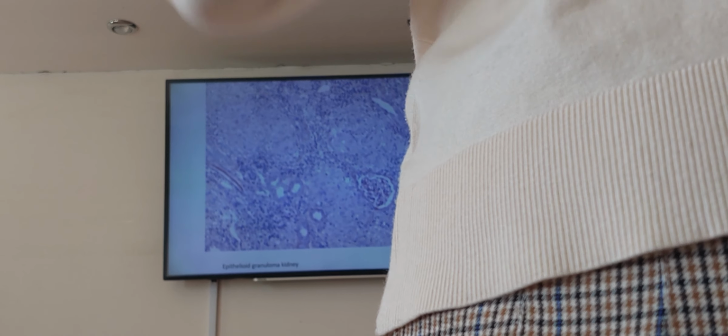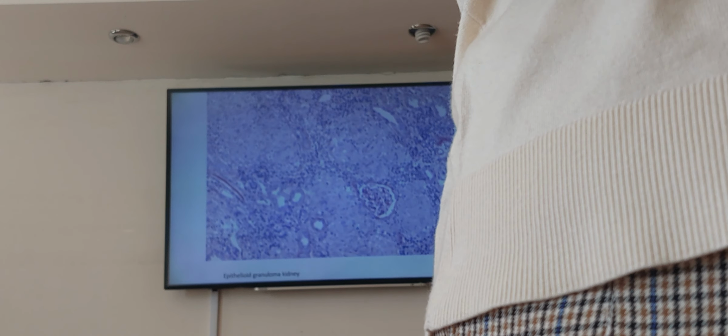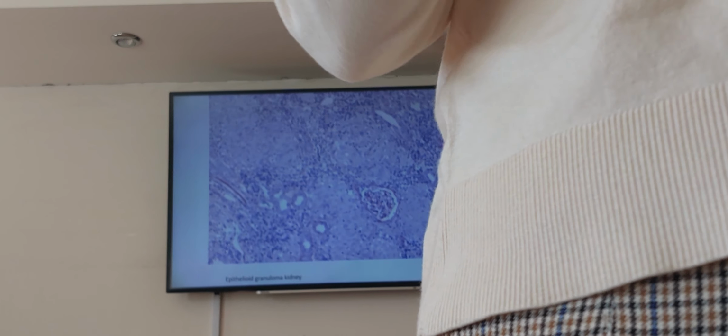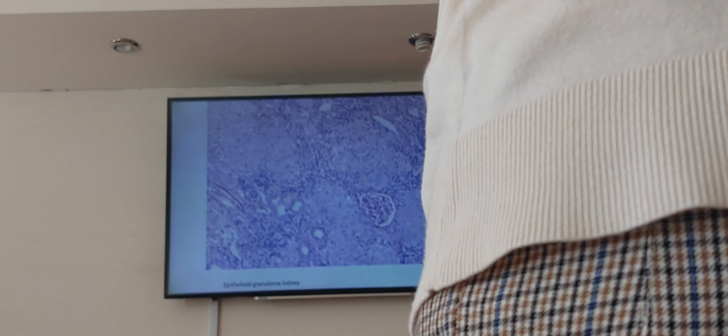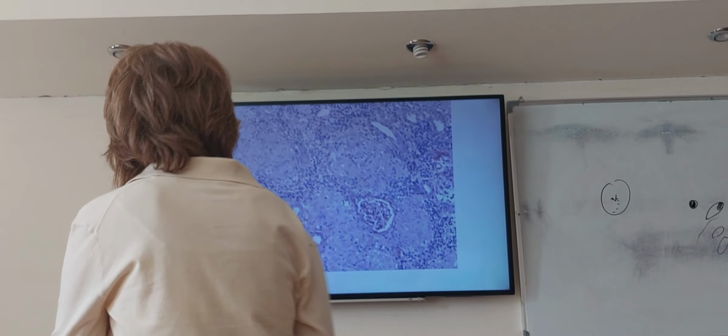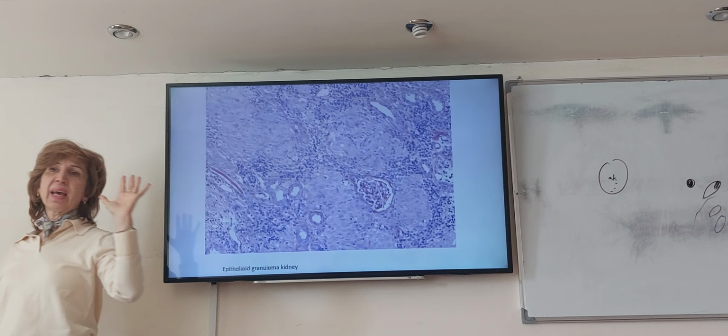In coagulative, I will see the shadows, but in caseous, granular acellular material, because it's like friable white cheese. It will be friable eosinophilic material. So I see just non-caseating epithelioid granulomas in kidney. That's the answer.